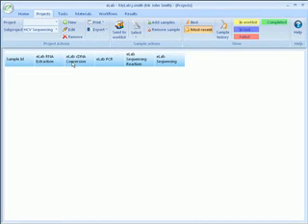See the sample management tutorial to learn how to add samples to this project. This is the end of this tutorial.